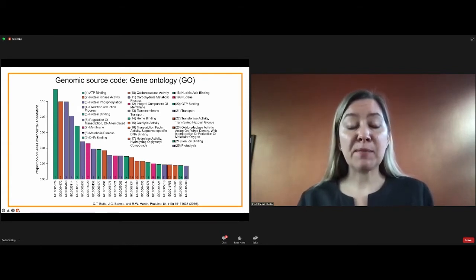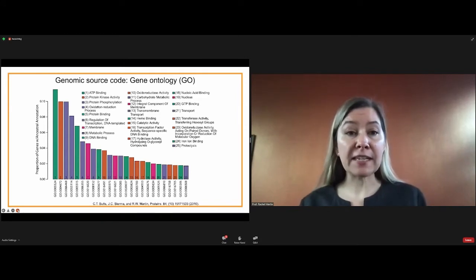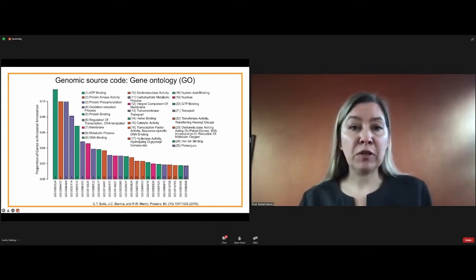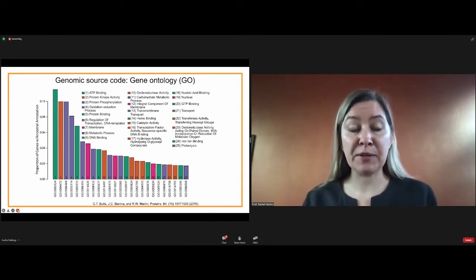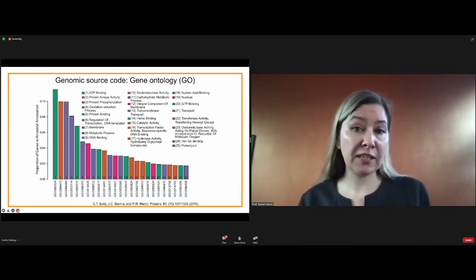I want to point out some of the quality control metrics that we use for a genome. One is, how much of the DNA did you read? We extract the DNA from the cells and read it, in this case using Illumina technology, and then we can see how much we have. From this particular organism, we expect about 300 million base pairs, and we got about 90% of that in our genome. So that's not so bad.